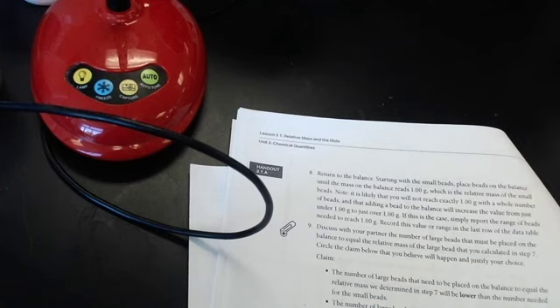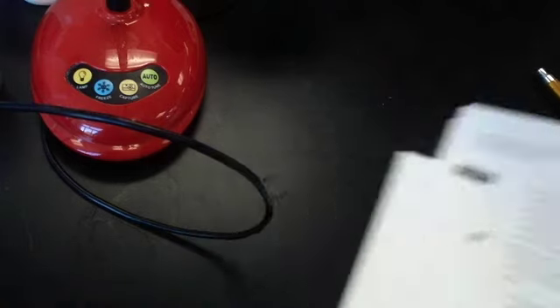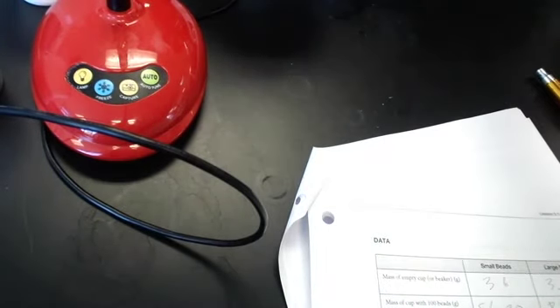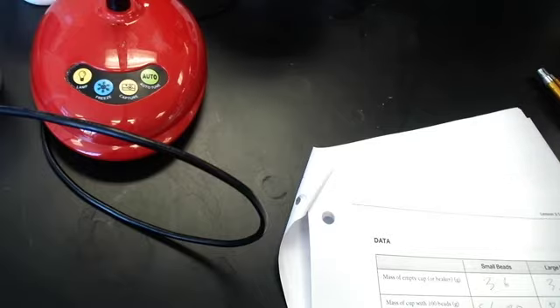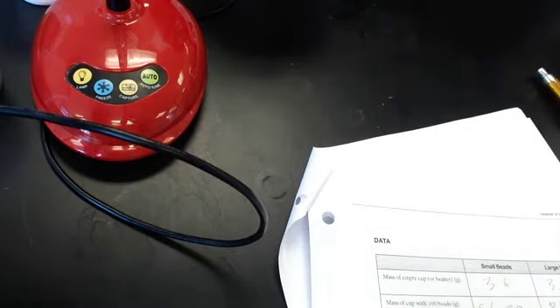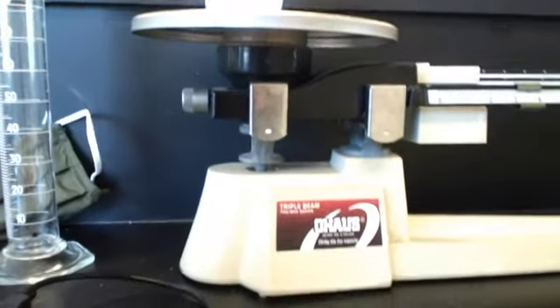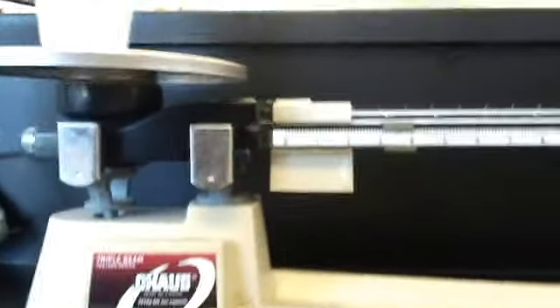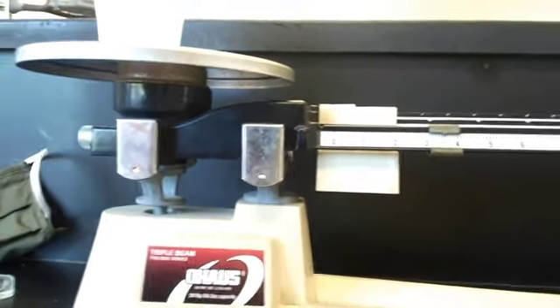If this is the case, simply report the range of beads needed to reach 1 gram. Record this value or range in the last row on the data table. Okay, so again, I'm going to see if the mass of my cup is approximately 3.5, because that's what it's been. That's what we're going to hope it to be here.